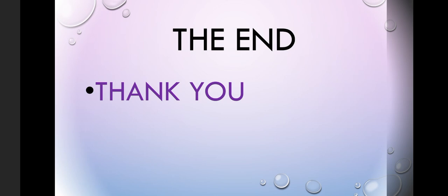And examples of hazards that we have listed today, we have slippery floor, we have open electric wires or electric sockets. We said that we have broken glasses that have been carelessly placed on the floor. All these materials are dangerous and they can expose you to danger. So, learners, I want you to always ensure that when you are in the lab, you maintain those rules that have been laid there that are meant to ensure your safety.